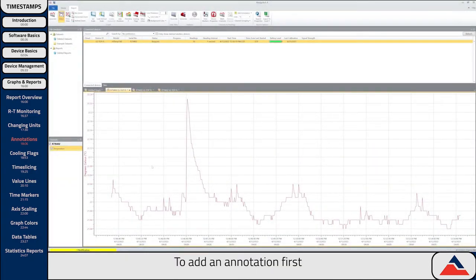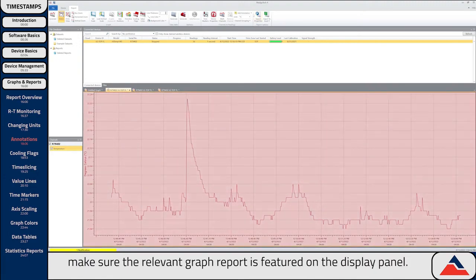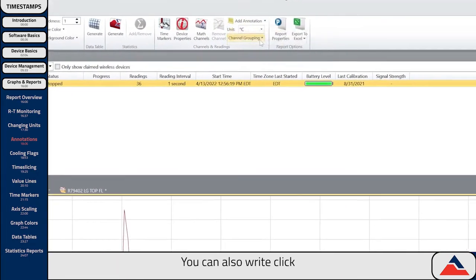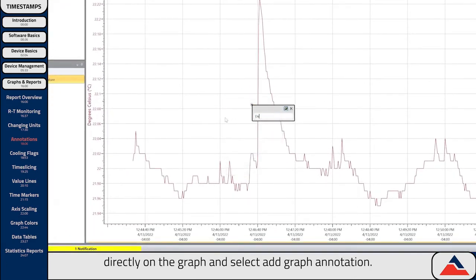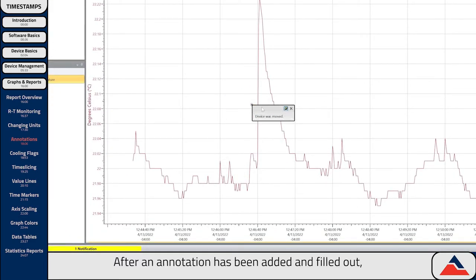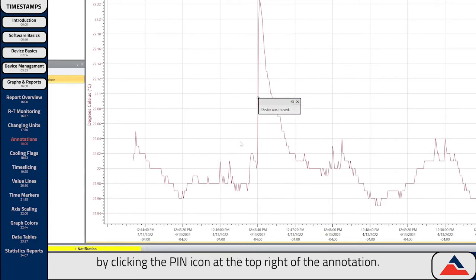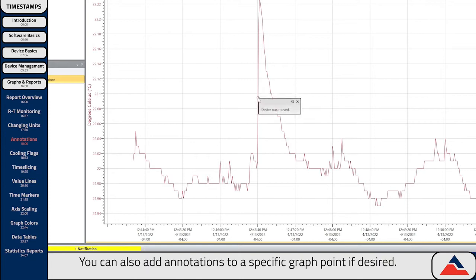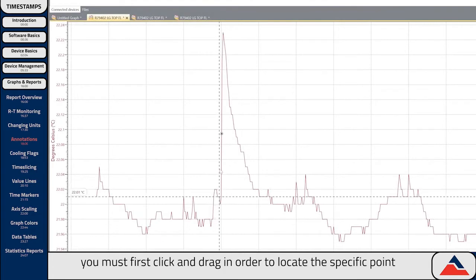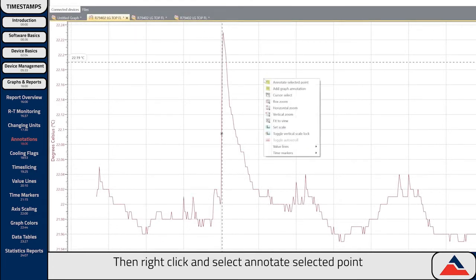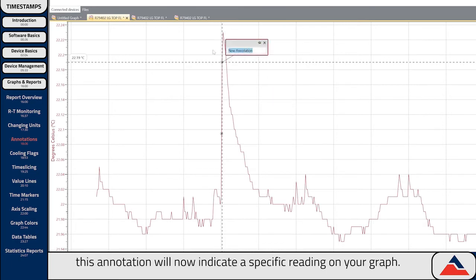To add an annotation, first make sure the relevant graph report is featured in the display panel. On the Reports menu bar, select Add Annotation to Graph. You can also right-click directly on the graph and select Add Graph Annotation. After an annotation has been added and filled out, you can toggle them on and off for visibility by clicking the pin icon at the top right of the annotation. You can also add annotations to a specific graph point. To do this, click and drag in order to locate the specific point you'd like to annotate, then right-click and select Annotate Selected Point.